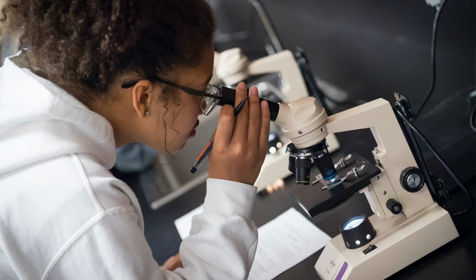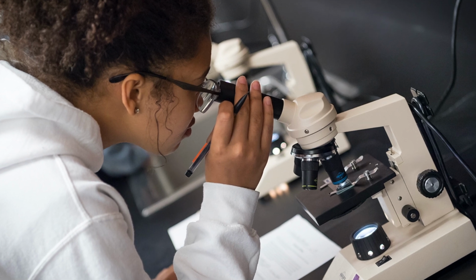Another lab group may investigate another independent factor, such as maybe the species of plant. Maybe instead of spinach, use some other kind of species. Another factor could be stomata density on the leaves. So whatever independent variable they choose, they commit to that, and then they will design their experiment around investigating the influence of that independent variable on the dependent variable, which would be photosynthesis rate.